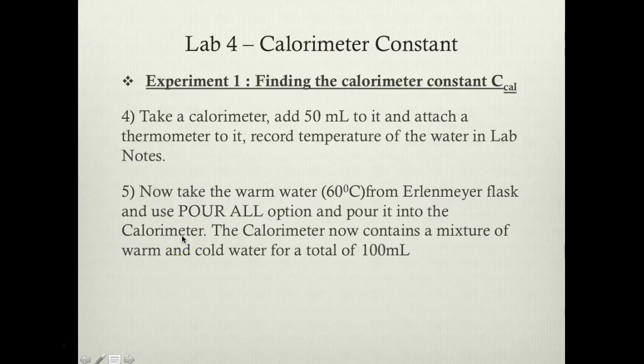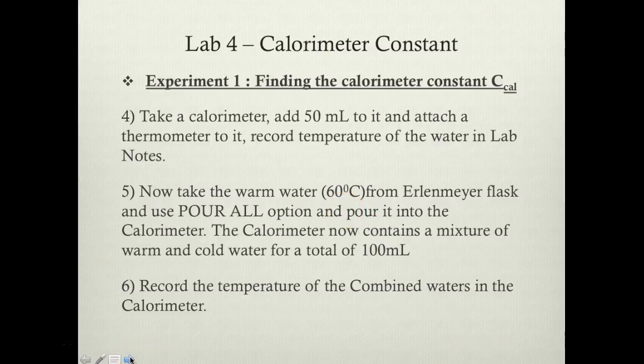Now the calorimeter contains a total of 100 mL of water. The temperature of this mixed water should go up from 21 or 22 degrees to some middle temperature like 40 degrees or so. So now record that temperature of the combined waters.